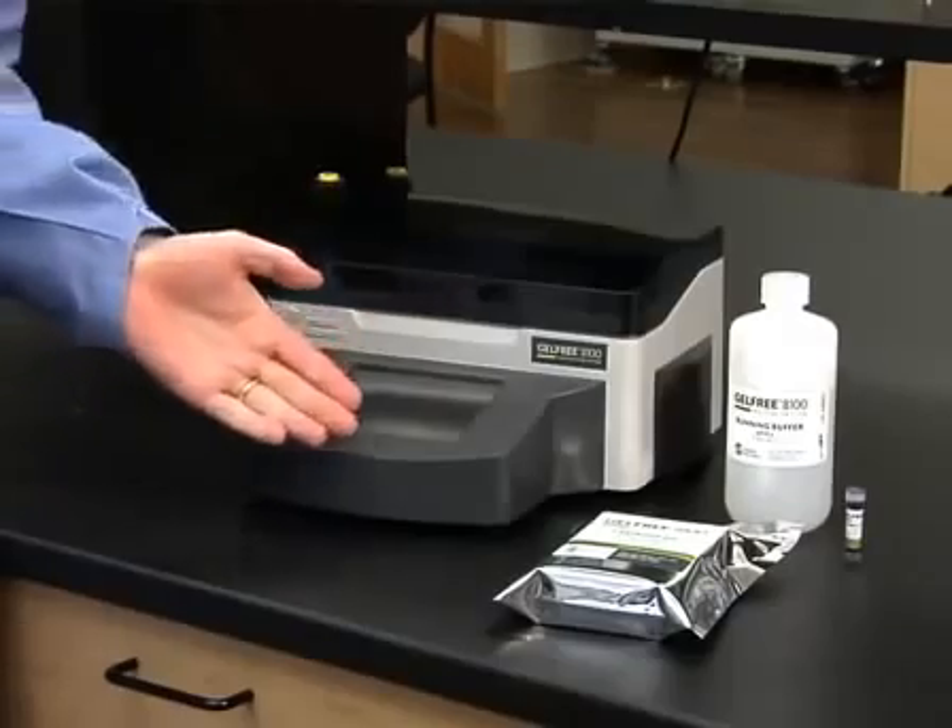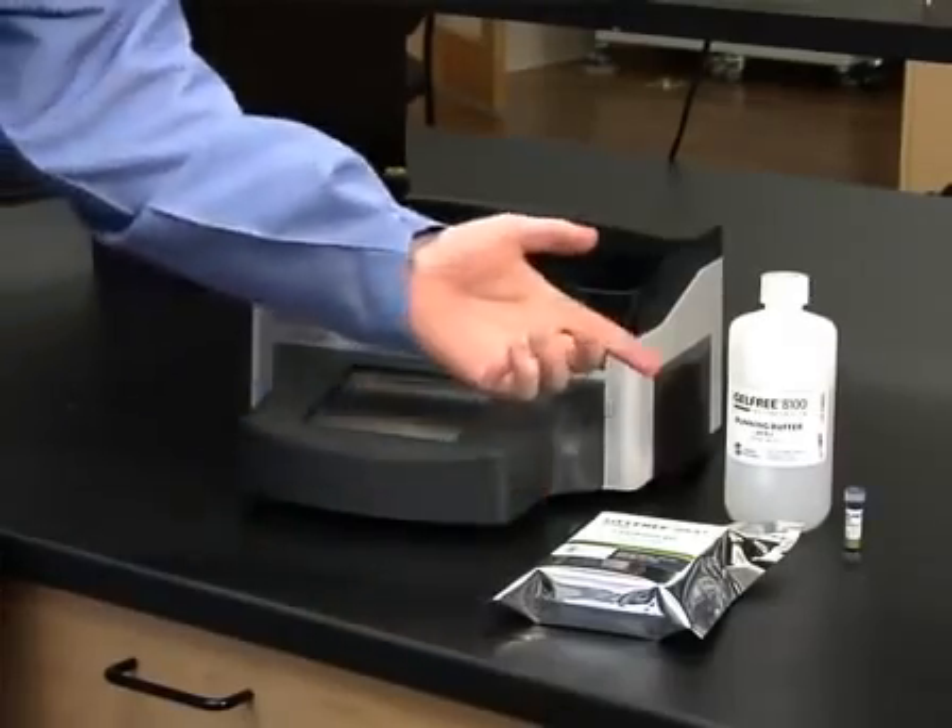Using gel-free, you can load up to one milligram of total protein per channel and reproducibly fractionate up to eight samples in about 90 minutes. The system includes an instrument, disposable cartridge, and all the buffers you need to perform the experiment.